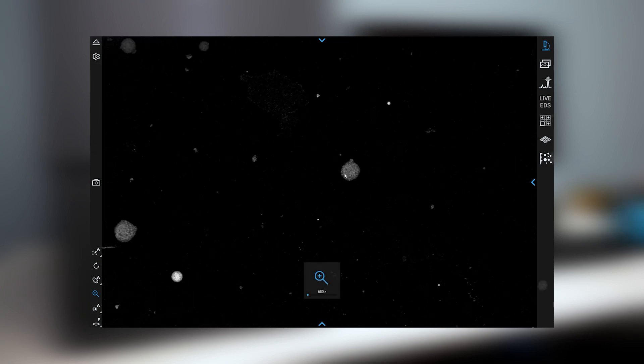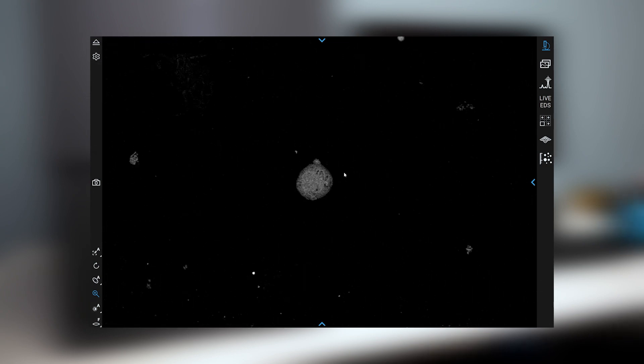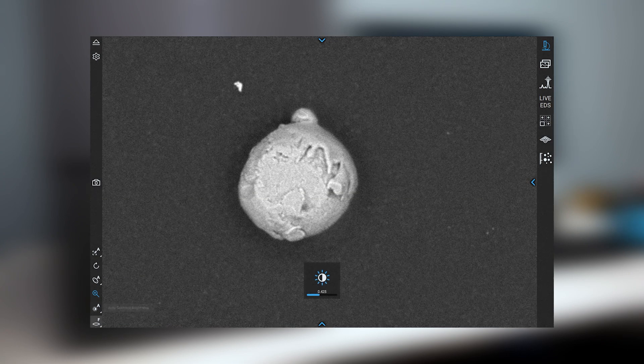We will be able to see very quickly here that an SEM image pops up on the screen and we can immediately begin collecting data.